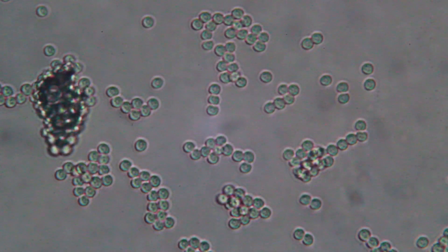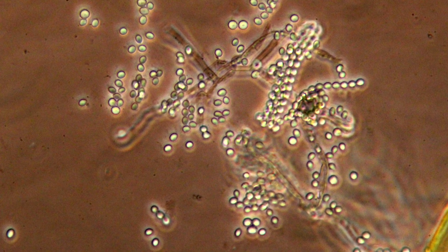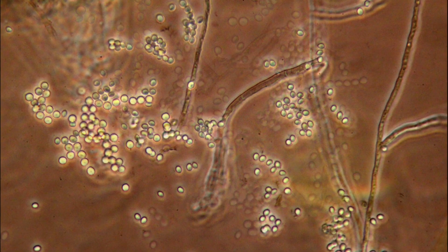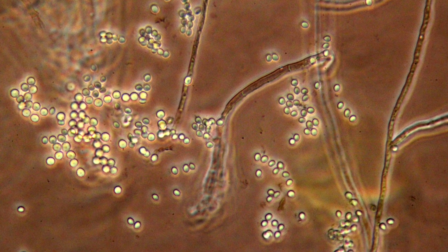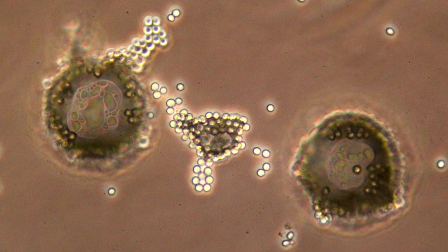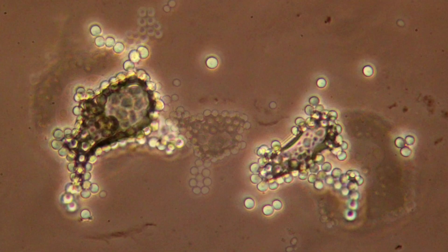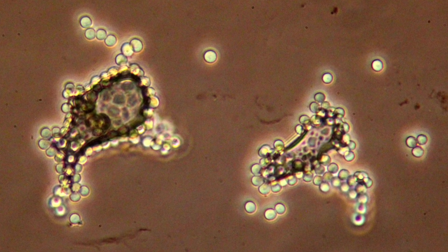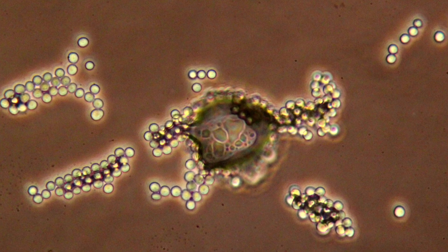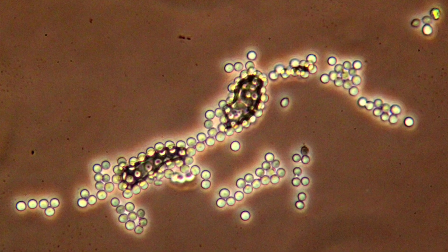Then I said, looks nice, but I want to try everything using my phase contrast microscope. And indeed, I was able to get a much better contrast here. You can also see the string-like structures — these are the hyphae, the cells of the fungus — the fuzzy part of the fungus. And yet again, a whole bunch of spores, very bright on a darker background. Phase contrast really improves the contrast of objects that are otherwise relatively transparent and difficult to see.